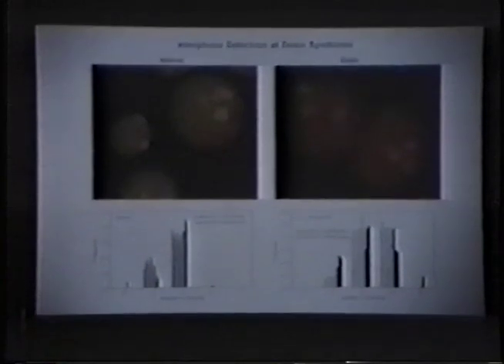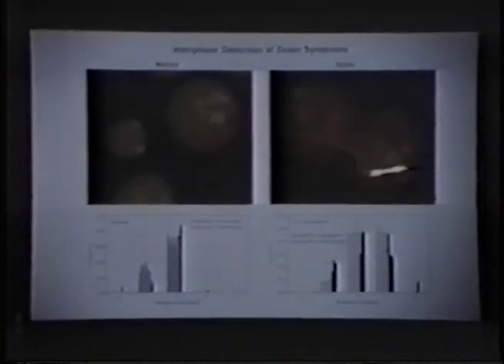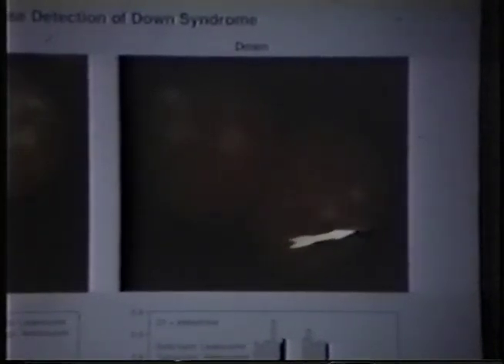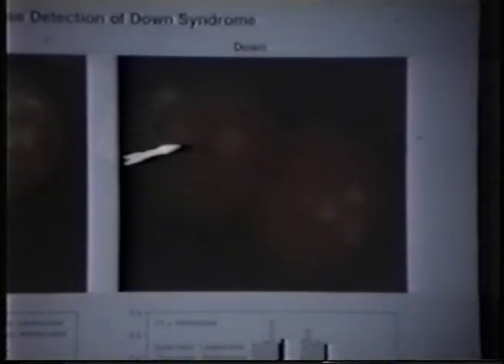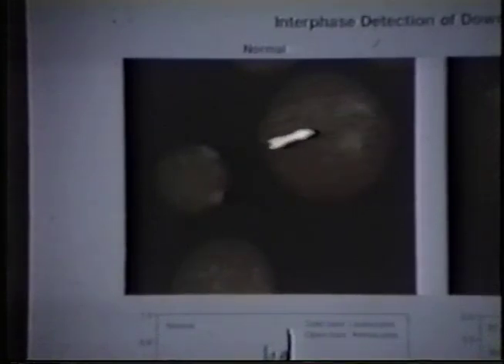These whole chromosome probes also allow you to look for aberrations in interphase nuclei. Here you can see hybridization with chromosome 21 to a patient with Down syndrome. And you can see the 3 copies of chromosome 21 in this nucleus and 3 copies of chromosome 21 in this nucleus. But you can see over here that in this normal spread, things are a little bit less clear.